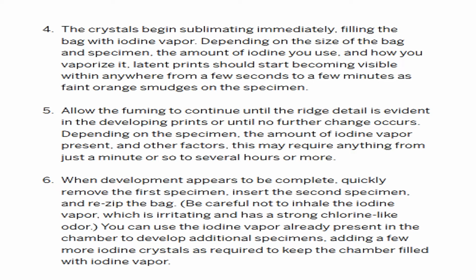Depending on the specimen, the amount of iodine vapor, and other factors, this may require anything from just a minute to several hours or more. So it depends upon the material present. If there is a single print, then just a minute is enough. When the development appears to be complete, quickly remove the first specimen and insert the second. If you want to do another one, you can insert it immediately.